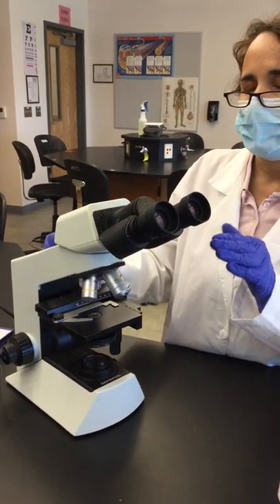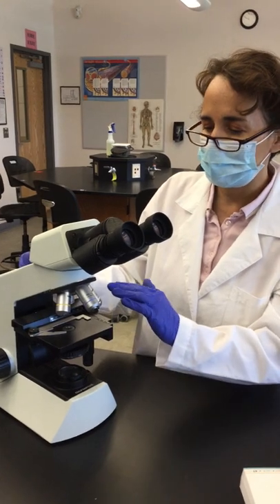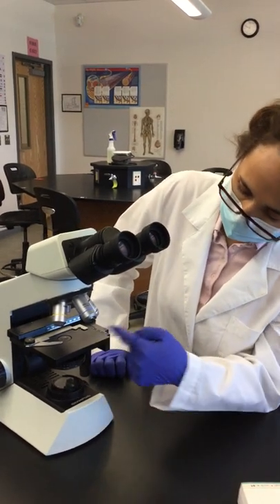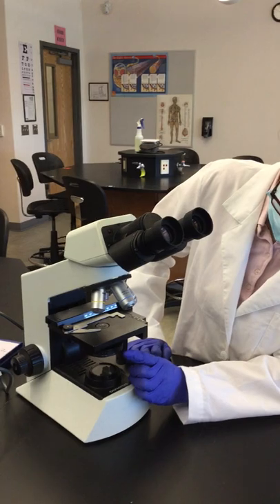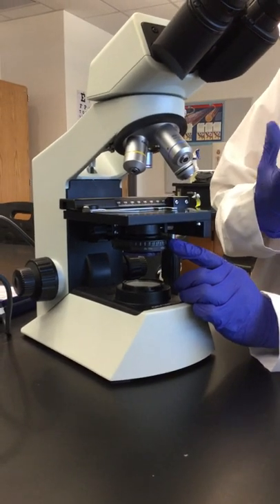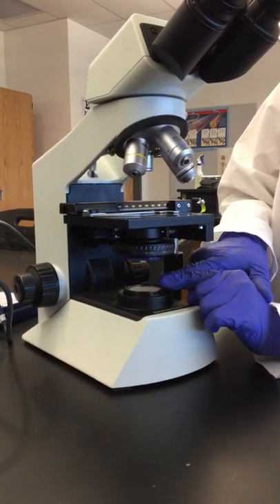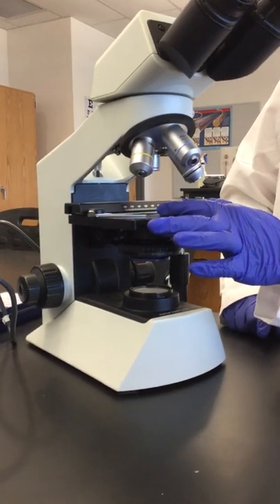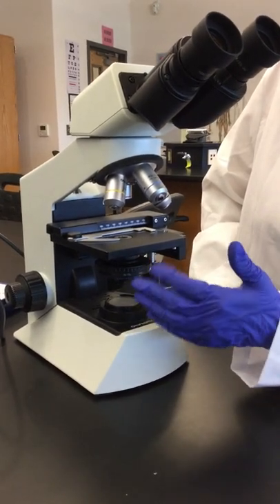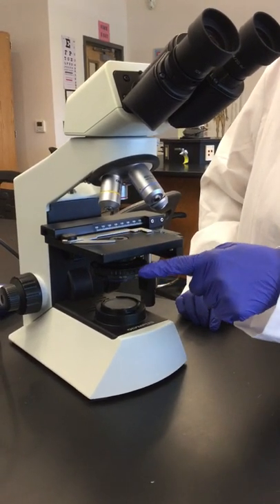The ocular lenses usually magnify the image ten times, and the objective lenses magnify at different magnification levels. Underneath the stage we have the diaphragm, which is used to change the amount of light that passes from the light source and condenser into the slide. Usually you don't move this — we set it to a particular amount of light — so just leave it as is.